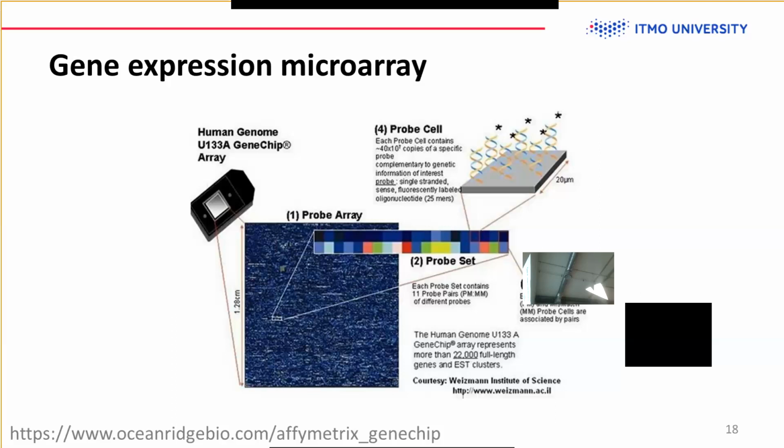Another thing about microarrays is that they are fluorescent ones. There is usually cross fluorescence between these probes, so you won't get zero signal. Even if for this probe there is no gene present in your sample, there will still be a non-zero value from cross interaction.